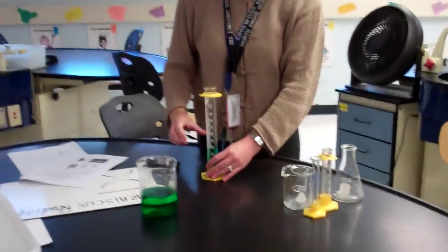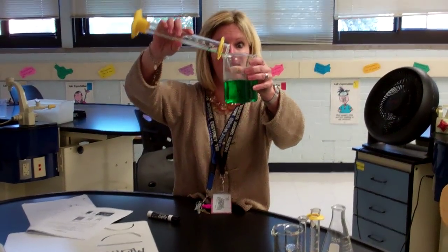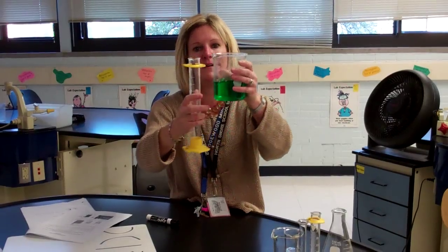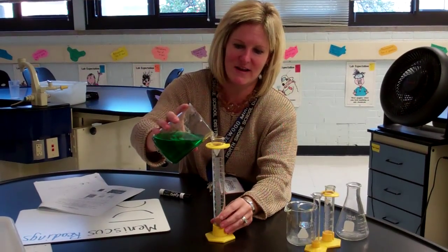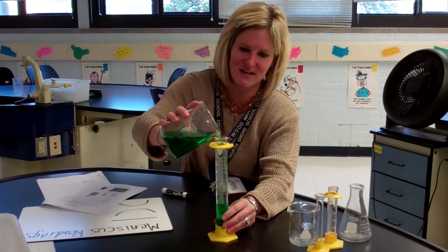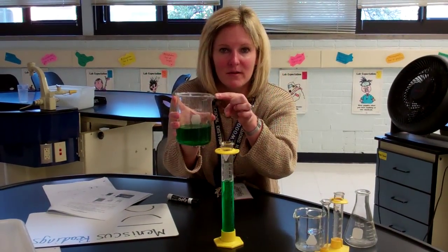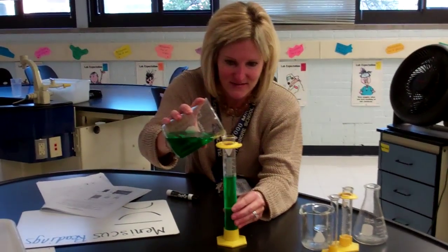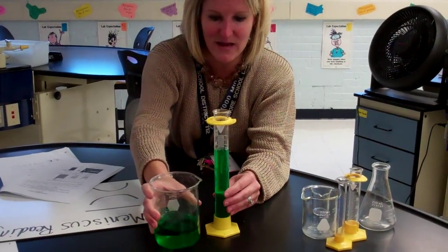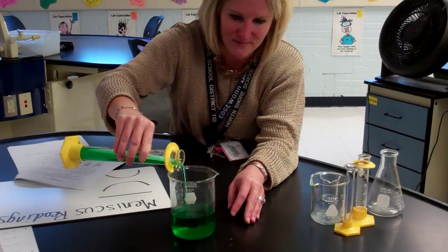Next is pouring on a level surface. Some of you like to do this, but Mrs. Tracy, you should always pour on a flat surface. Oh my goodness, how could I forget? The reason being is obviously we don't want anything to splash or irritate your skin, and it's much safer to pour on a level surface with the lip. That's the purpose of the lip, to pour nice and slow. Of course, if you make a mistake, you can always carefully pour it back into the other container.